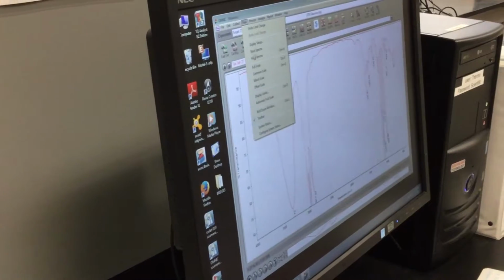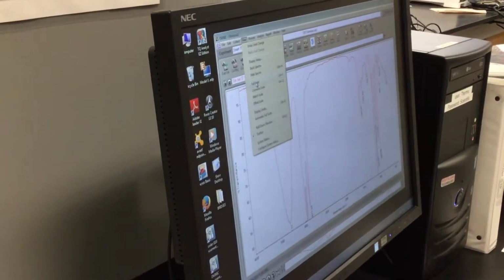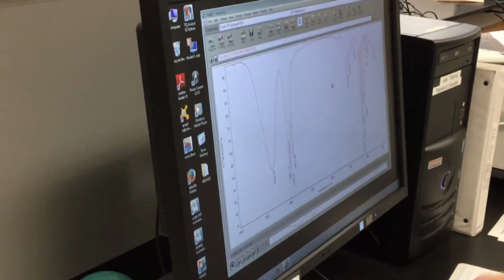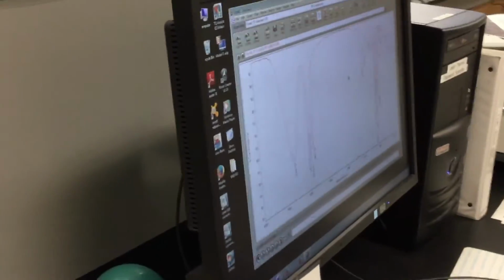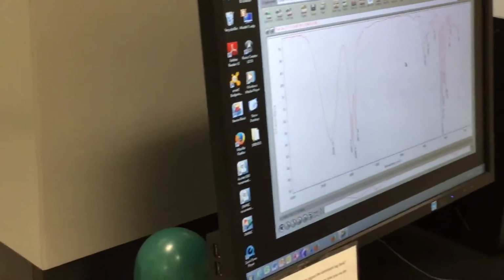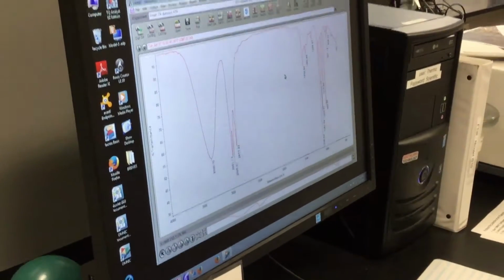And if you go view full scale, it's Control F. So you can do it with the mouse or you can do it with the command key. I just do Control T, Control F, but you'll get used to it. But if you forget, you can always go to the menu bar and find it there. So now when I did Control F, all my numbers are on screen. So now it's looking pretty.